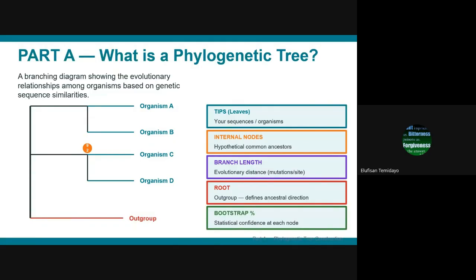Then we want to see where it is coming from. Has it branched from its family, or is it part of the family? Are they the same thing, or is something very different about them? It's going to give us their genetic context, their evolutionary makeup. That's what phylogenetics is going to point out to us. It's going to tell us how they are related to one another.